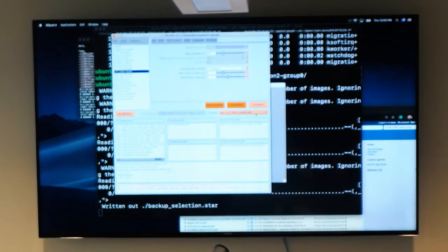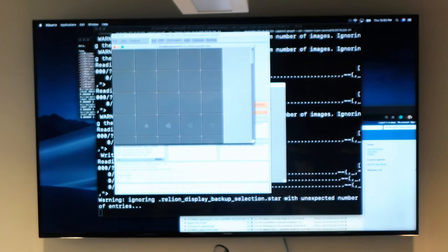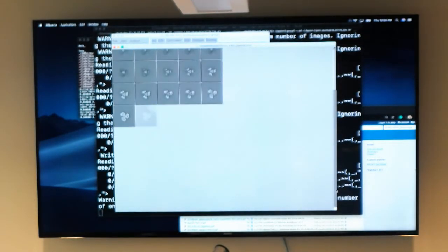The reason I'm showing you that is that if I displayed the model, as I mentioned, it's 2D slices through a 3D projection, and some people may be used to seeing this view, some people may not. But these are actually 2D slices through a 3D body, right?